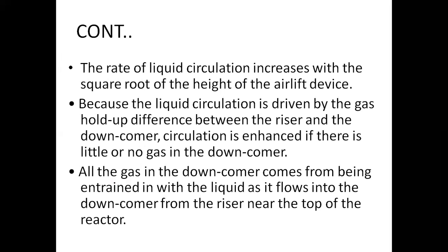The rate of this liquid circulation increases with the square root of the height of the airlift device. As a result, because the liquid circulation is driven by the gas hold-up difference between the riser and the downcomer, the circulation is enhanced or improved if there is little or no gas in the downcomer. So basically the focus is that there should be no hold-up of the gas or air in the downcomer.